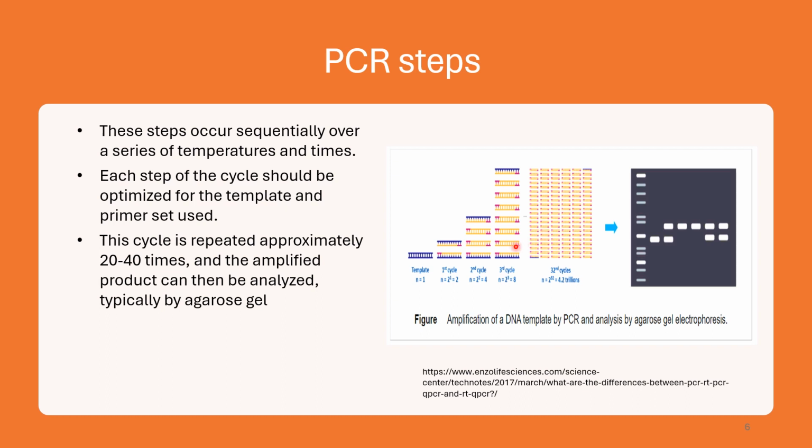A portion of the tube's content is typically analyzed using gel electrophoresis and stained with ethidium bromide dye. Agarose gel electrophoresis separates the DNA fragments in a mixture according to their sizes. The smaller fragments move farther through agarose gel than the larger fragments. Ethidium bromide binds to DNA and fluoresces when excited under a UV light. If the amplification was successful, then a product called the amplicon can be detected as a band on the agarose gel.